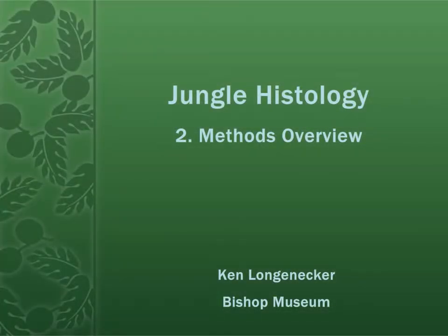My name is Ken Longenecker, and this is the second of 9 modules designed to teach anybody who's interested how to perform the methods my colleagues and I use to do rapid reproductive analysis on reef fishes. In this module, I'm just going to present a brief overview of the techniques. Before I show you those techniques, I'd like to explain why we chose a histological or microscopic approach rather than a gross visual or macroscopic approach to analyzing fish gonads.